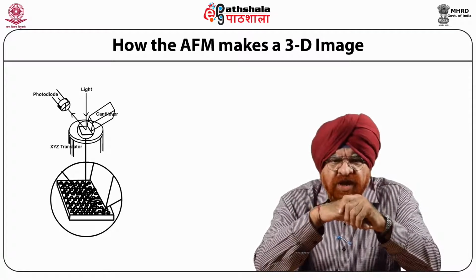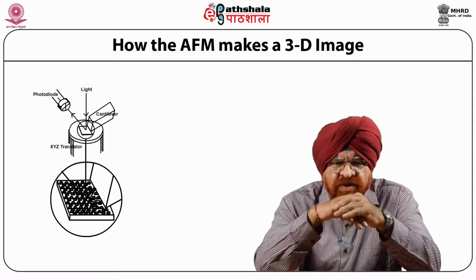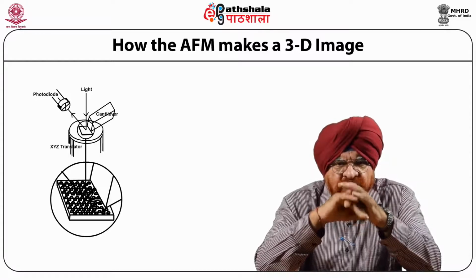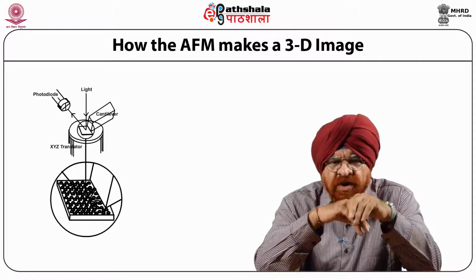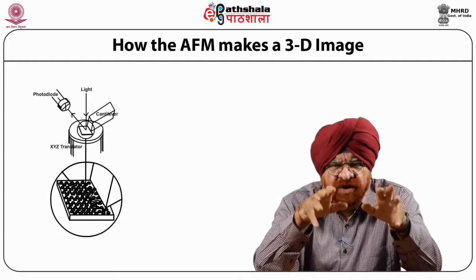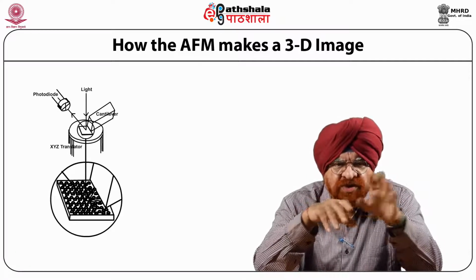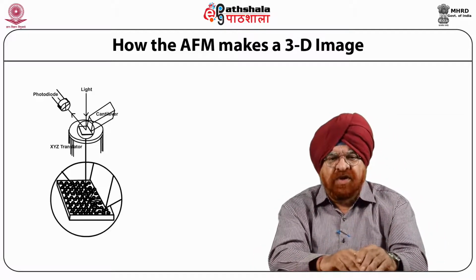For image display, we select the vertical Z and horizontal XY ranges independently to best present the surface structure. This has been repeated because of the importance of this particular point.